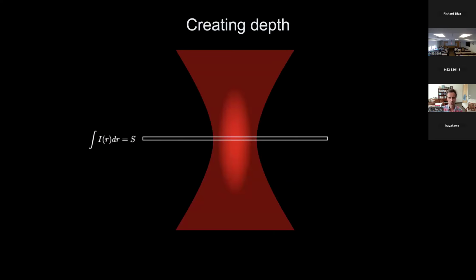So if you look at this, an additional rendition of this focus, now in an hourglass form, because we want to indicate that light really comes from below and then travels through focus. The light gets condensed, and then it kind of wavers out again, okay? And we are drawing a line here in the middle. That is our focal plane right there, okay? And we're going to integrate that light here, and I call it S. So that is just the light intensity in focus, all right? And as you can see, in the middle here, that's my focal volume, okay?